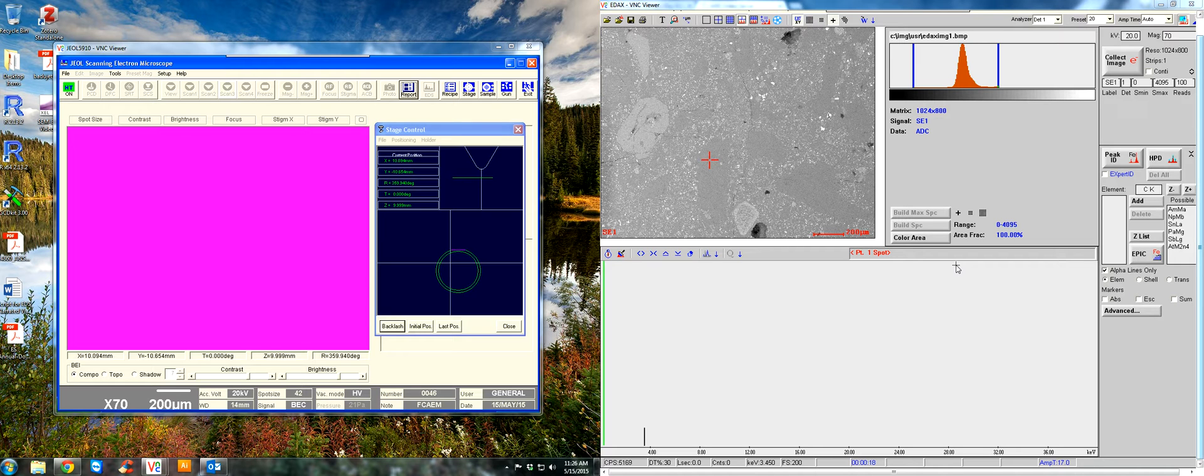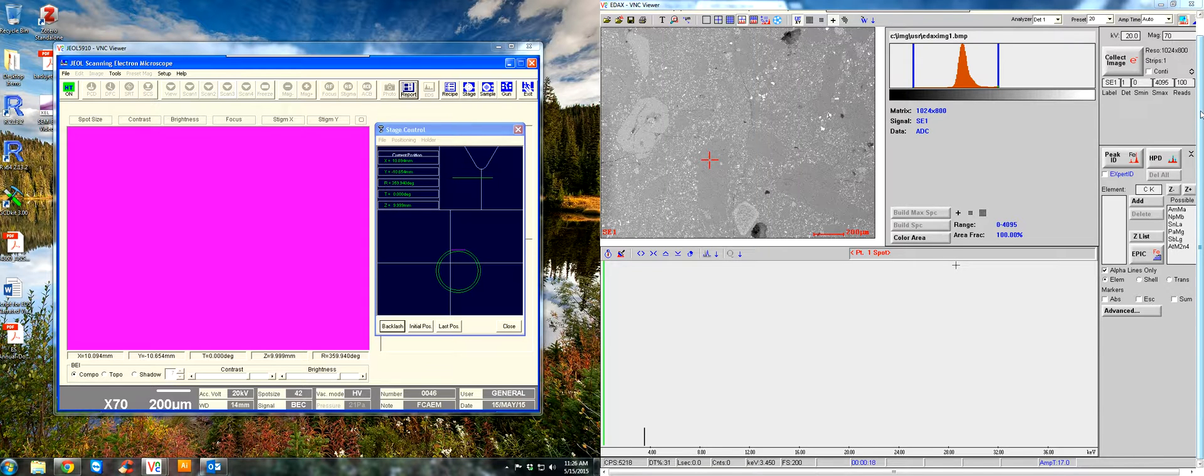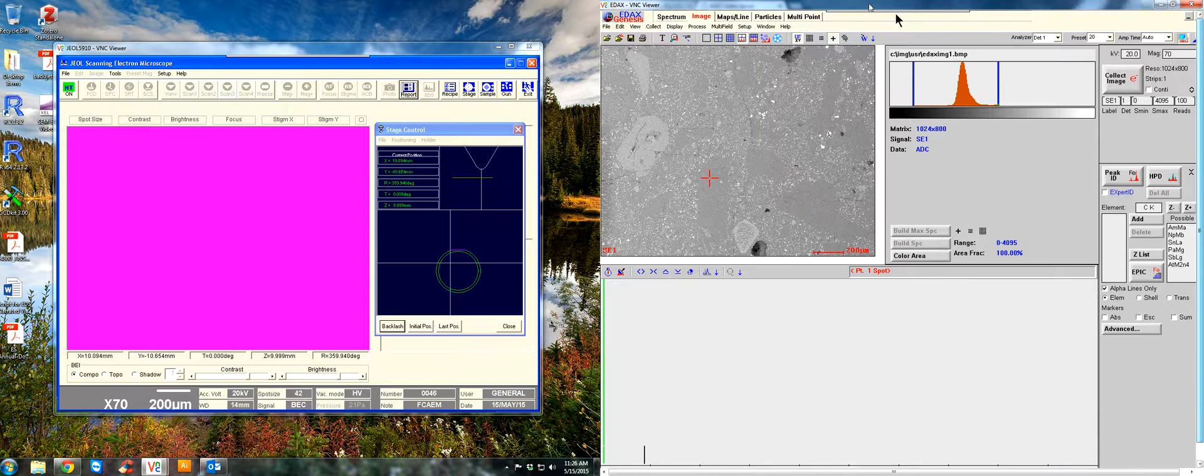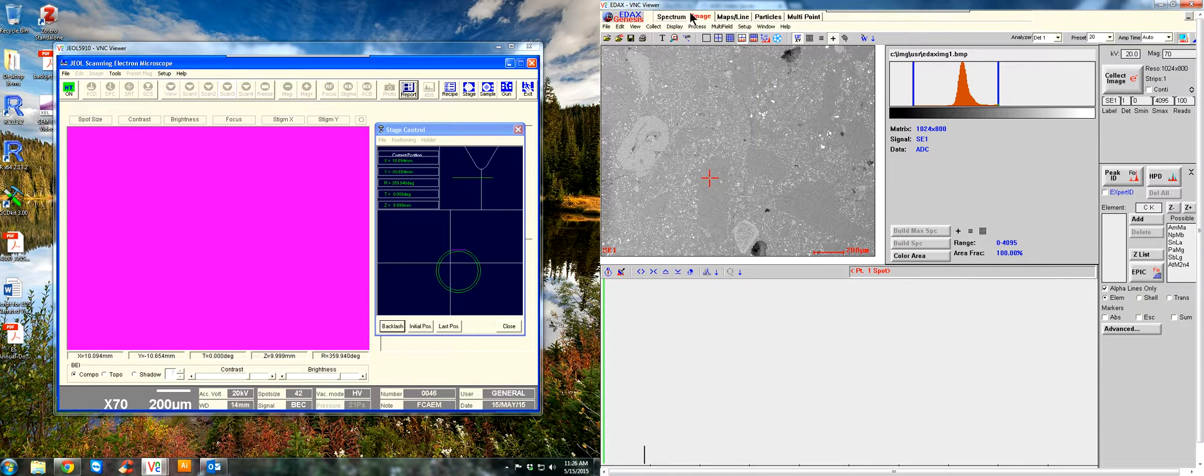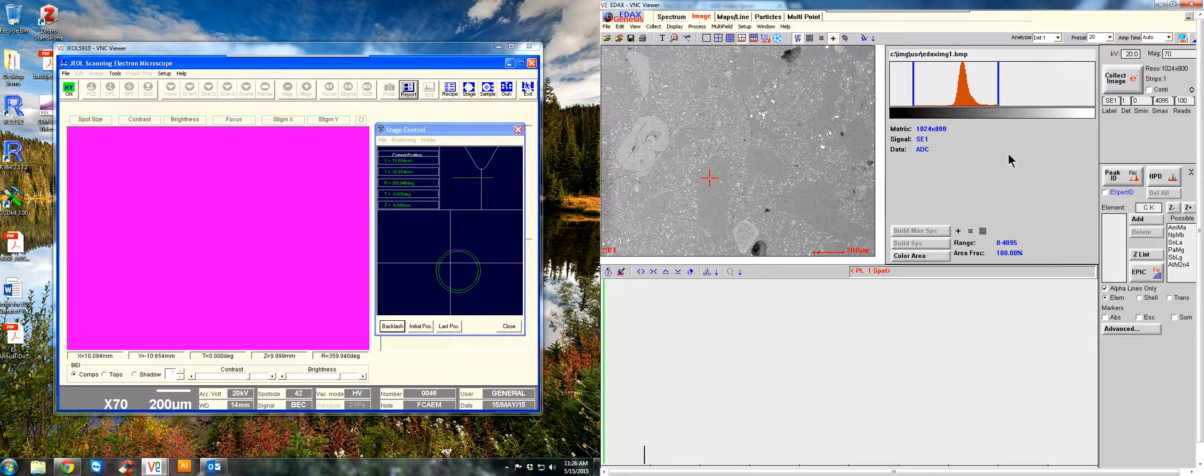Alright, let's do some quantitative analysis on the Genesis software in the image tab, which we're on right now. This is assuming you've already collected an image, adjusted the contrast and brightness, and this is your region of interest.